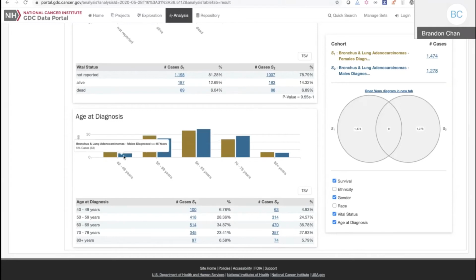There are small differences, but if you look at sort of the comparison of the bars, again, fairly similar. So I can't, again, say if that has any scientific significance, but these are the trends that you can use the tools to look at to lead you in future directions of exploration.